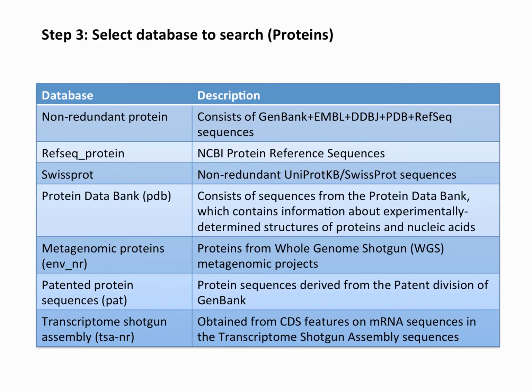In the case of protein sequences, we have the sequences of proteins that are included in GenBank, reference protein sequences, the non-redundant UniProt knowledge base and SwissProt databases, sequences of the Protein Data Bank, and sequences that come from genome shotgun projects, patents, and transcriptome.